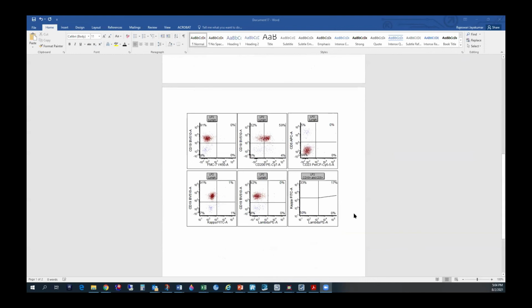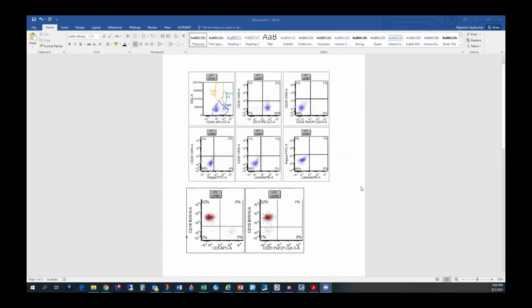Go ahead. So what they did was they first did a bone marrow biopsy. The patient had a history of follicular lymphoma and now had some fatigue and B symptoms. But in the last 2 years, he did not receive any rituximab. So they did a PET and they found one spot in the bone marrow that lit up. They tried a bone marrow biopsy that did not help, so they went on and did an FNA biopsy of the bone marrow. We didn't run everything because we only got very minute tissue for flow. So we only did the B and T cell tube, and there was nothing in the T cell tube, empty. This is all we got.